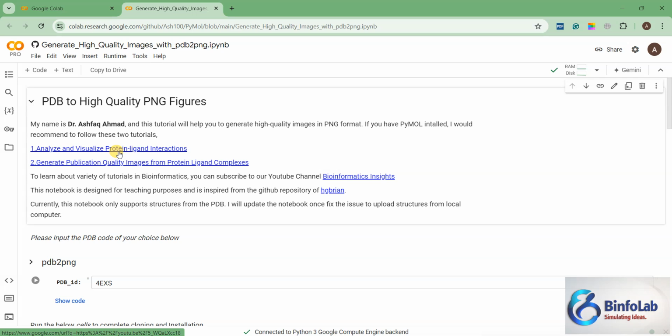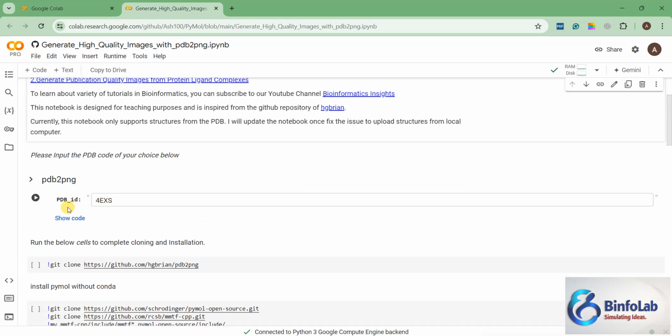But if you are not familiar with PyMOL or you have some problems in the installation, although I have also covered a video for installation, you can see on the channel. But if you still have some problem, then you can use this tutorial for some of your work.